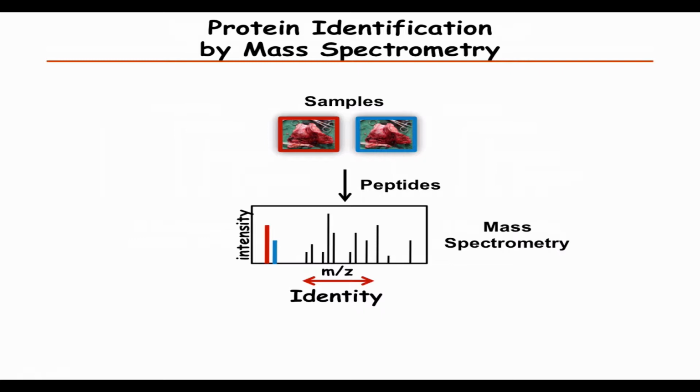Charges, you mean? Yes. If you have bigger charges in MALDI, I haven't seen that. In electrospray, definitely. Even if you have a small protein, you can get those kinds of charges. In MALDI, I don't think I've seen much more than 15, maybe, for quite a large protein. Maybe you could get something bigger, but it's difficult to get such high charges.